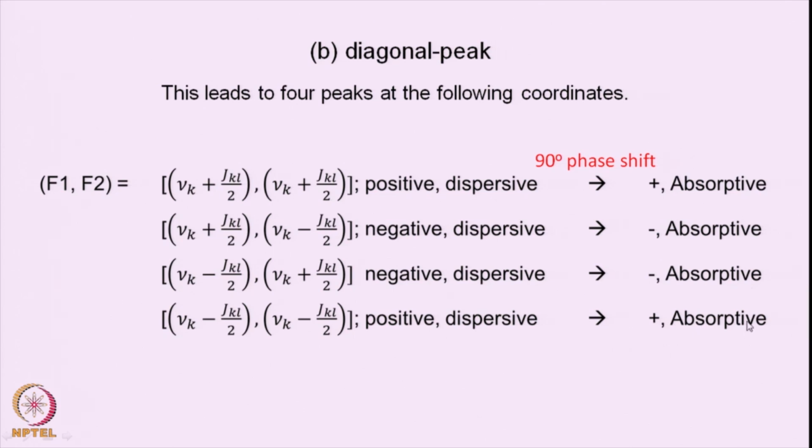This is the important difference with respect to the COSY, that both the diagonal and the cross peaks have the same line shapes and also a positive negative component structure, and therefore if I do a phase correction on the entire spectrum, then I get absorptive line shapes in both the diagonal and the cross peaks at the same time, and additionally I will have plus minus structure in the diagonal as well.